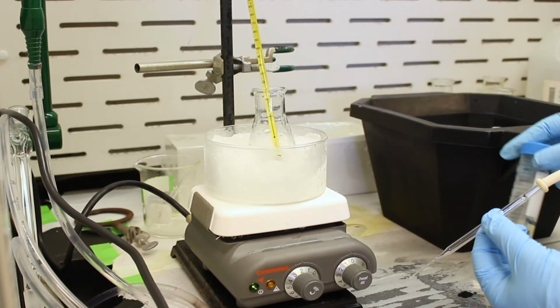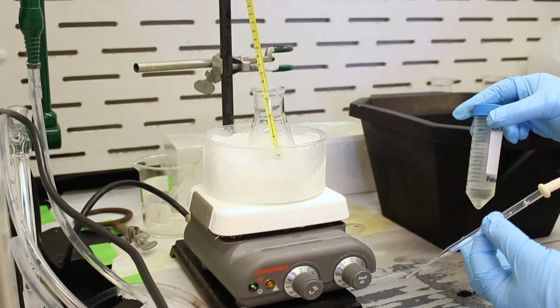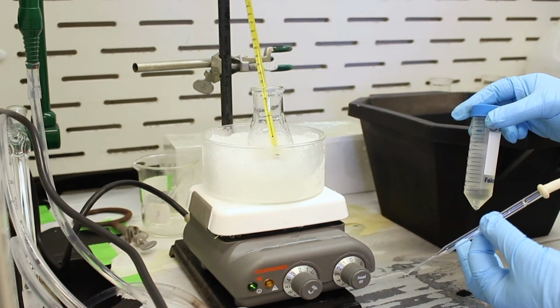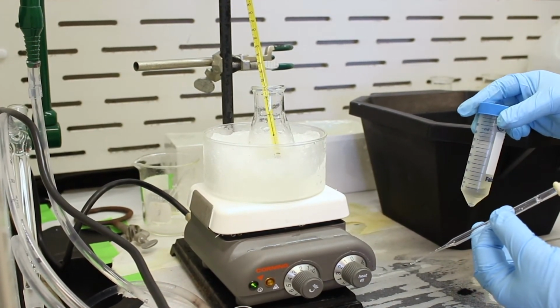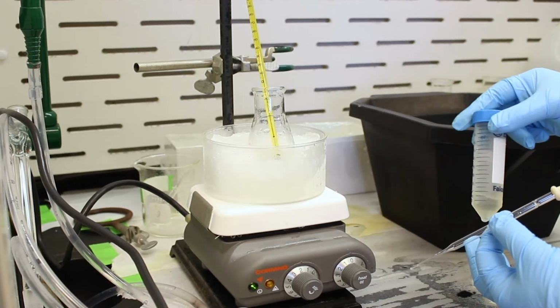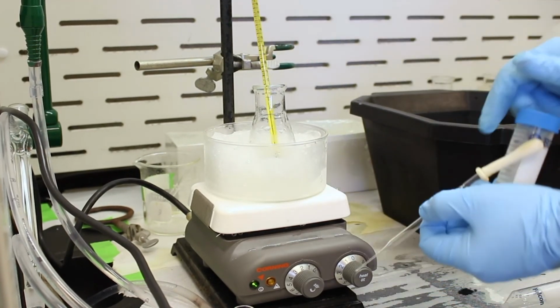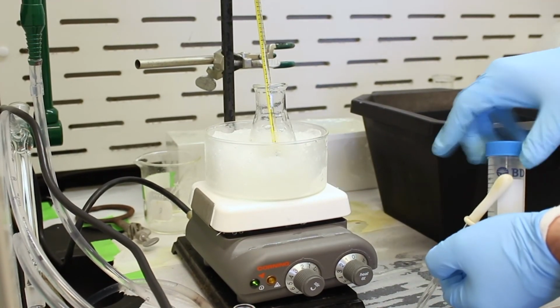So this reaction, we want to keep it below 15 degrees Celsius. The reason is if it exceeds 15 degrees Celsius, you start to form other side products like the ortho and para isomers. If you give enough energy, it'll form the less stable products. So we want the meta product. So we want to keep this reaction cold, below 15 Celsius.